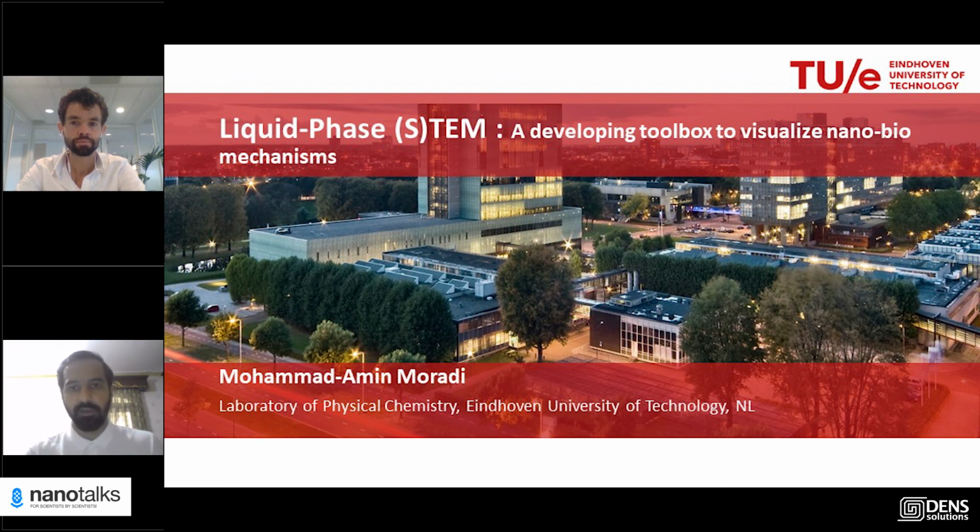thermocouple and increase the temperature, so that with the change in the structure of the polymer, we can move the liquid. These are the preliminary results that we are obtaining these days. And I hope that soon we are able to show them to the audience. All right, nice. Thank you.